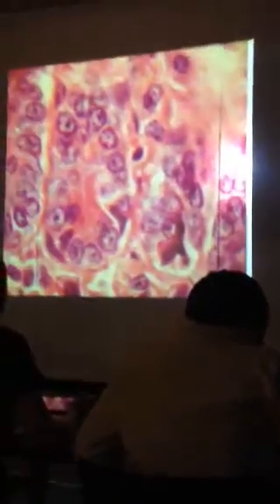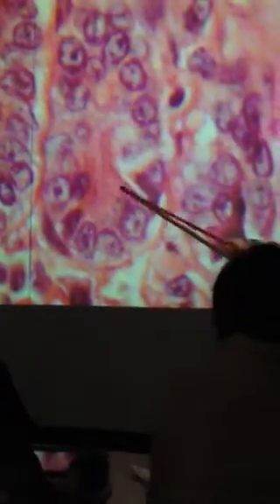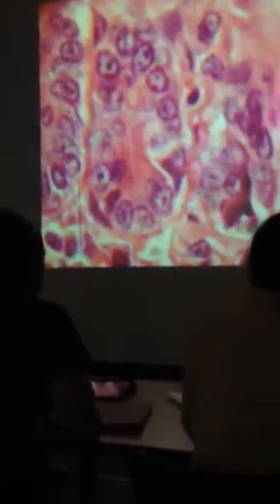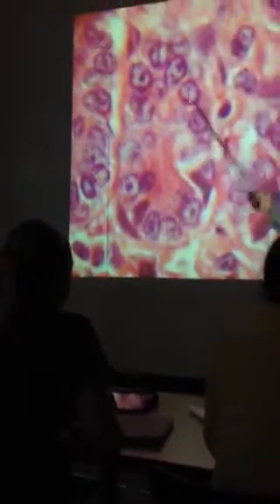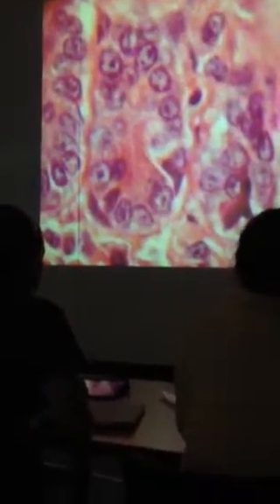All right, this is another one. See this one right there? There's another enteroendocrine cell. Now this one might be from the stomach. These look like they could be chief cells, and with the pink, this could be down in the gastric gland because that might be part of a parietal cell. See the eosinophilic appearance of it? So again, as you get into the different tissues, you'll see some differences. Notice you don't see goblet cells scattered up amongst here, but you do see lots of, obviously, some purple cells and then some pink cells. I wouldn't ask you this for parietal cell, though. I'll show you a really good parietal cell in a little bit.